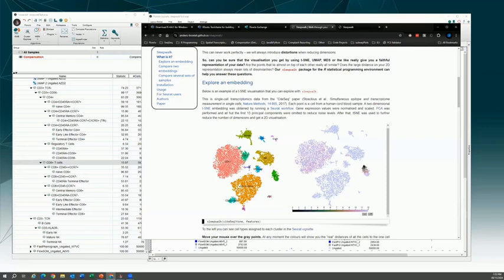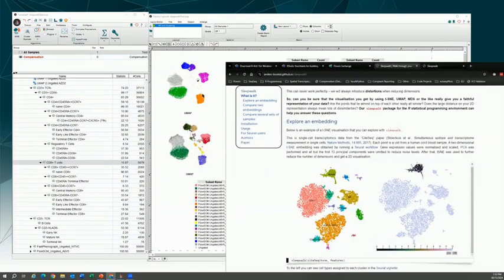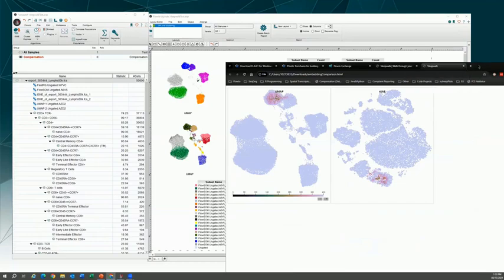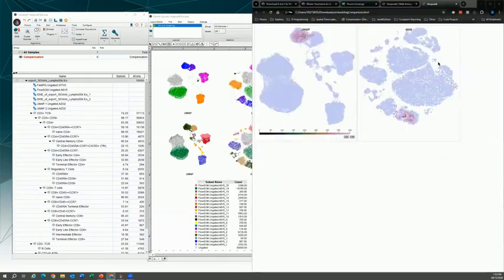Strangely, if you go to this tip here, even in these B cells, for this particular point, there's this area where the CD4 and CD8 T cells light up. So what I did was I took these embeddings that I ran on this data set, and I generated the same type of plots with Sleepwalk.